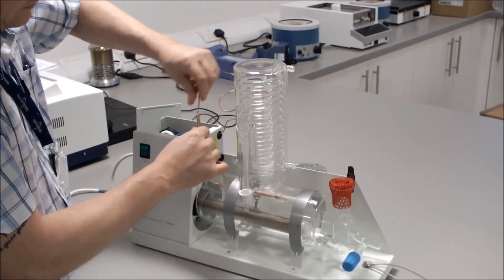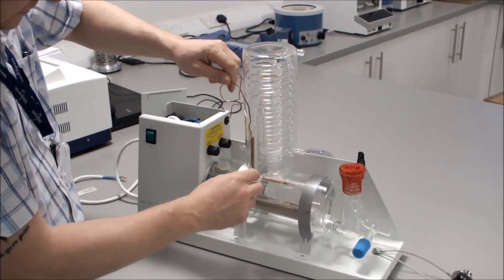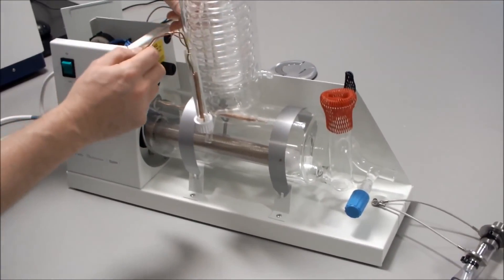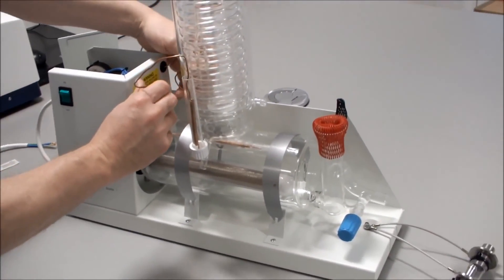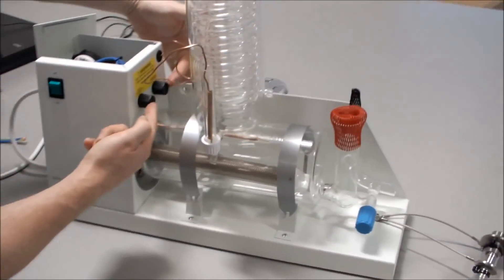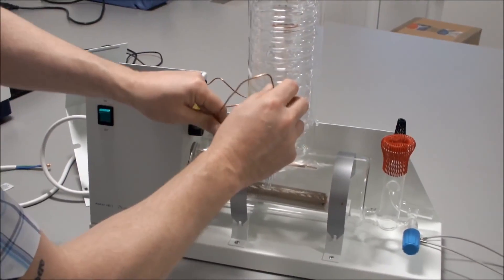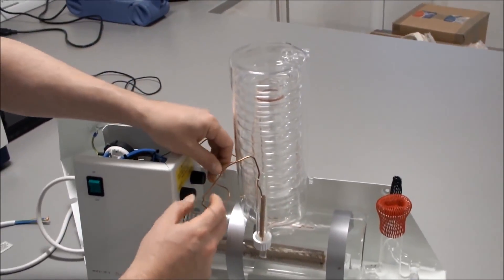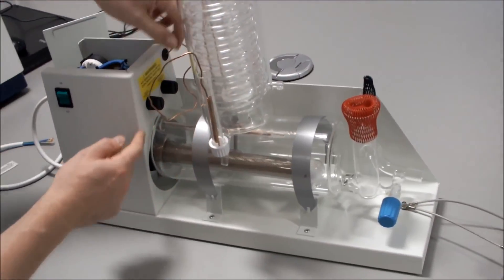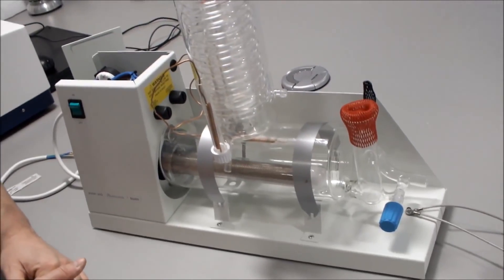Straighten out the condenser thermostat, place it in the tube. We need to arrange the condenser wire so that it does not obstruct the two thermostat reset buttons. Arrange the wiring anywhere so that you are not restricting the reset buttons and can press them if needed.